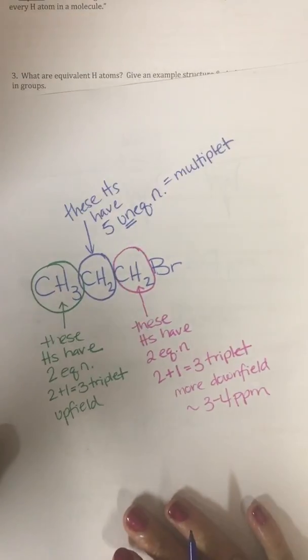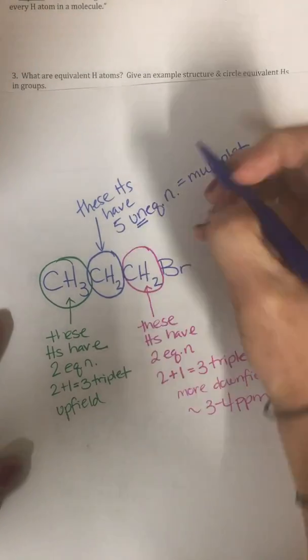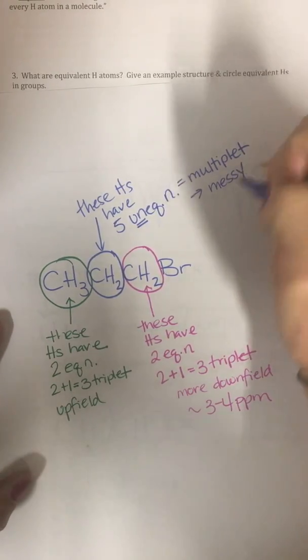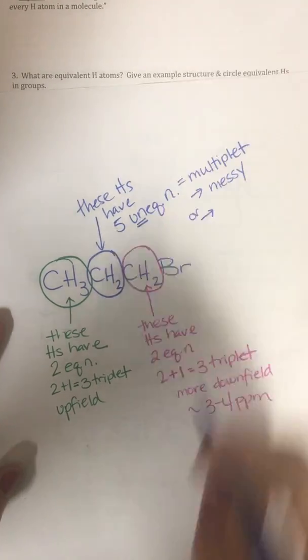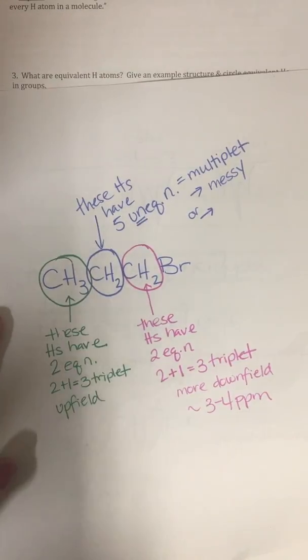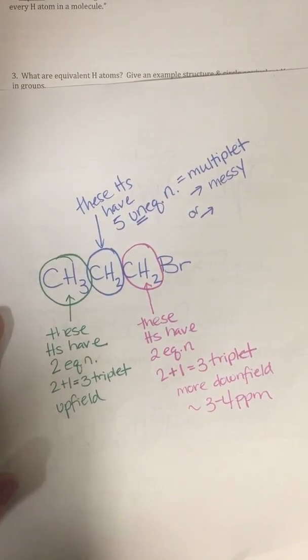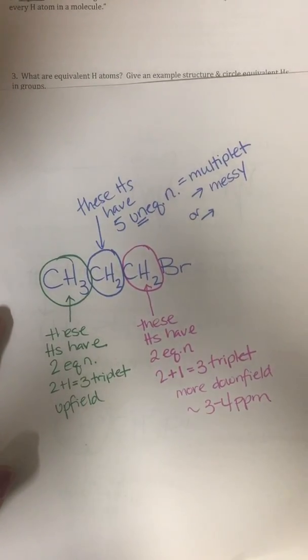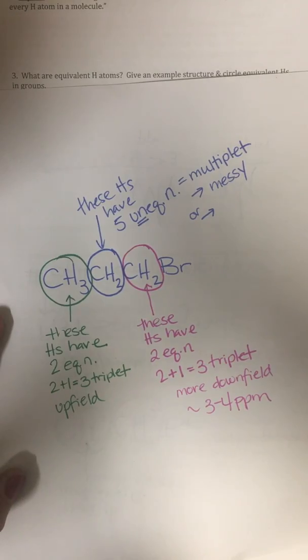Now, sometimes multiplets look very messy on a spectrum, or depending on how many electronegative atoms are in that molecule, it helps the splitting become a little bit more clear. Now, bromine, again, is not that electronegative, but sometimes you can count the peaks, but I will always label if it's a multiplet or not.